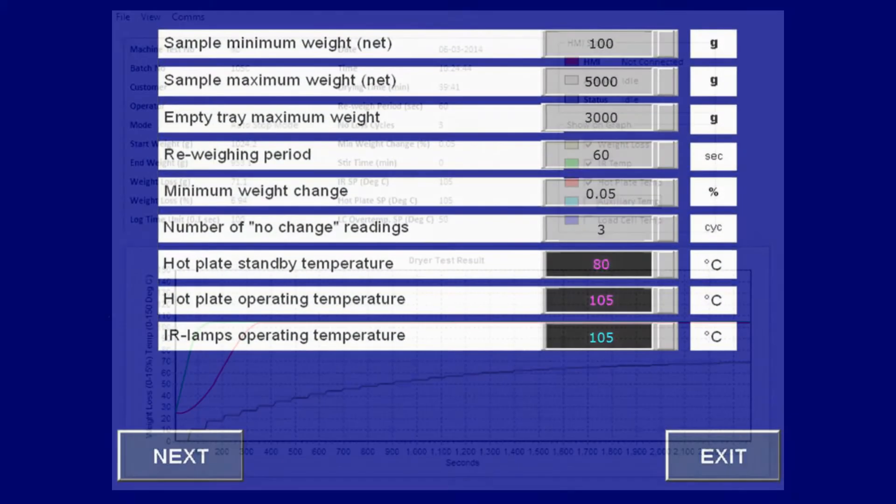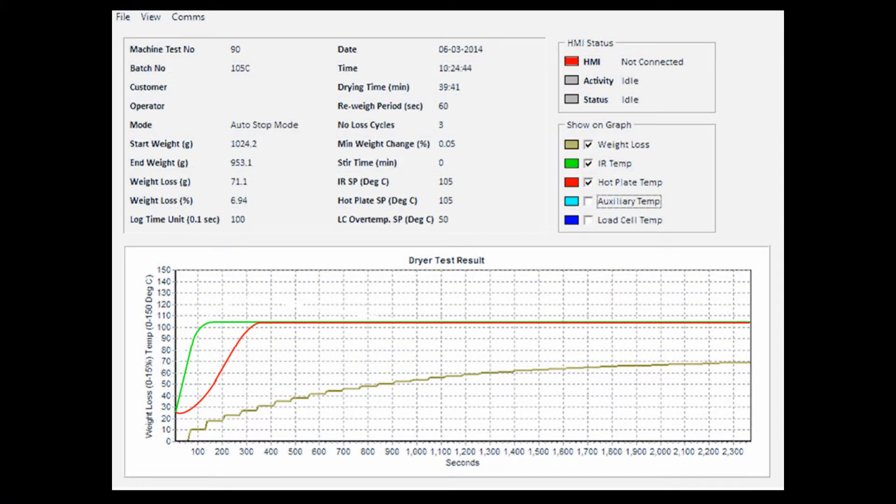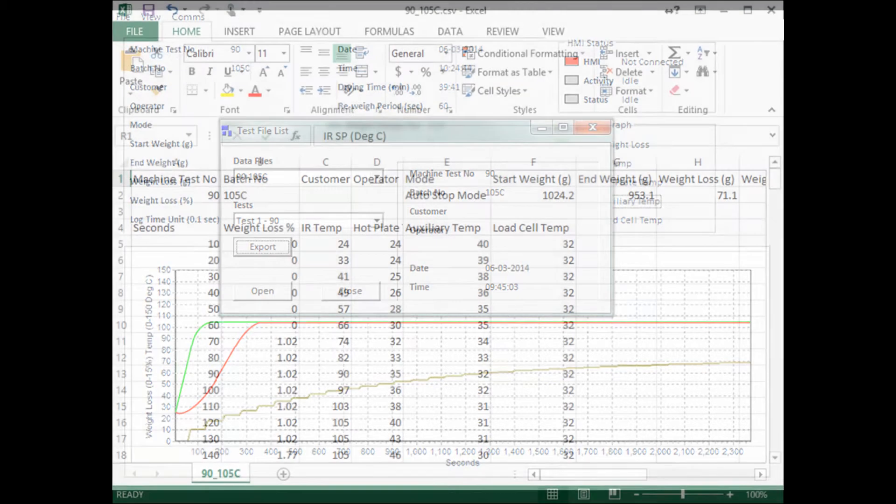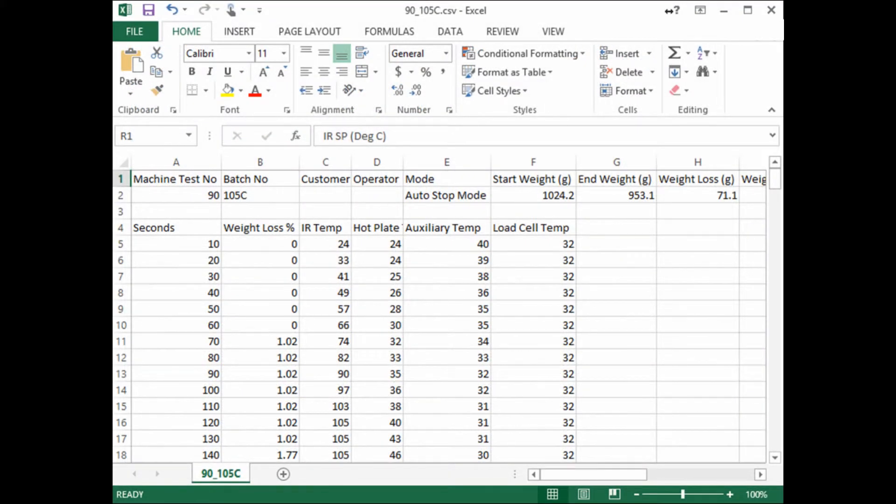Temperature and mass readings can also be monitored on a computer through an Ethernet connection to the oven. At completion of the drying cycle, this data can also be exported to a CSV file for analysis.